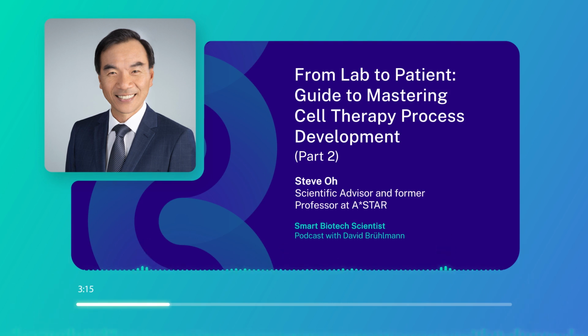And because we had the microcarrier as the support material, and we put laminin on it, so shout out to biolaminin also. We put laminin on it, the cells stayed in the pluripotent state. And then when we pushed them to one stage of differentiation, we had a high percentage, 80 to 90%. And we switch and put it to another media condition, another high differentiation to the third stage and so on. That was really what I spent 15 years trying to solve for 3 or 4 cell types.